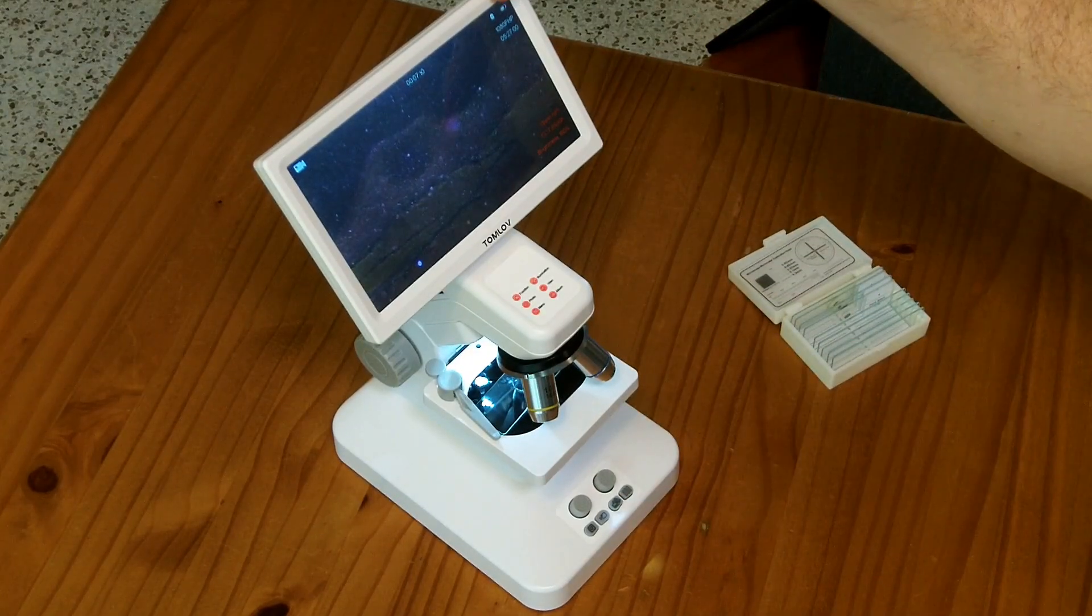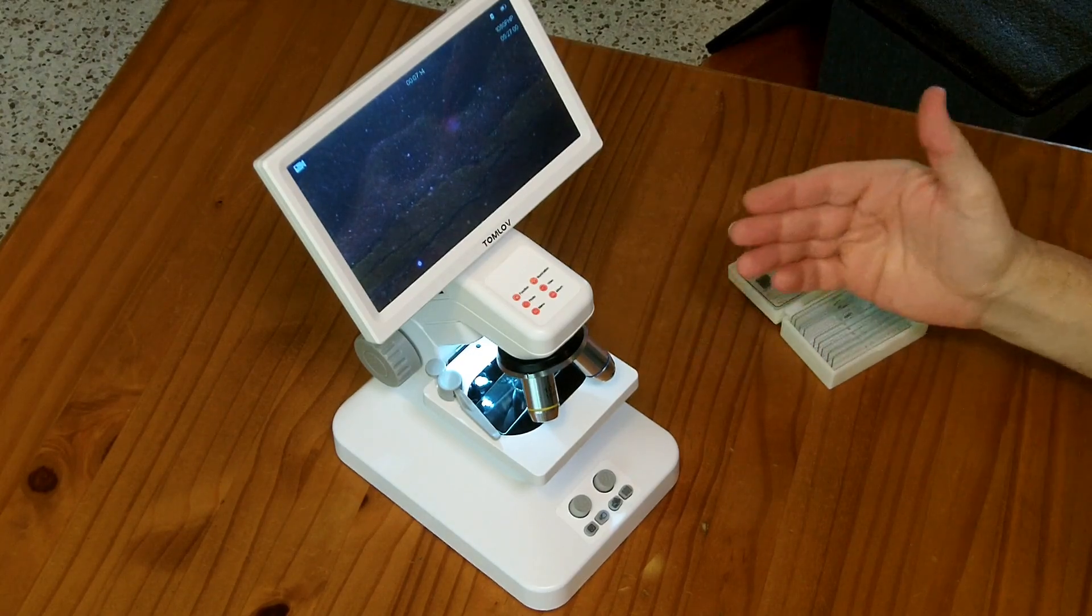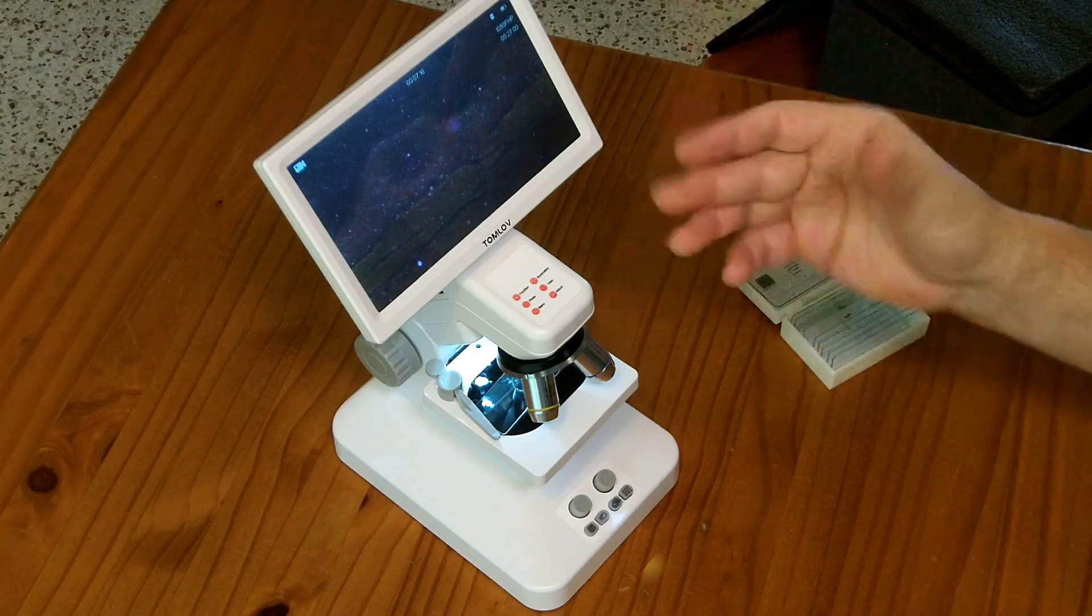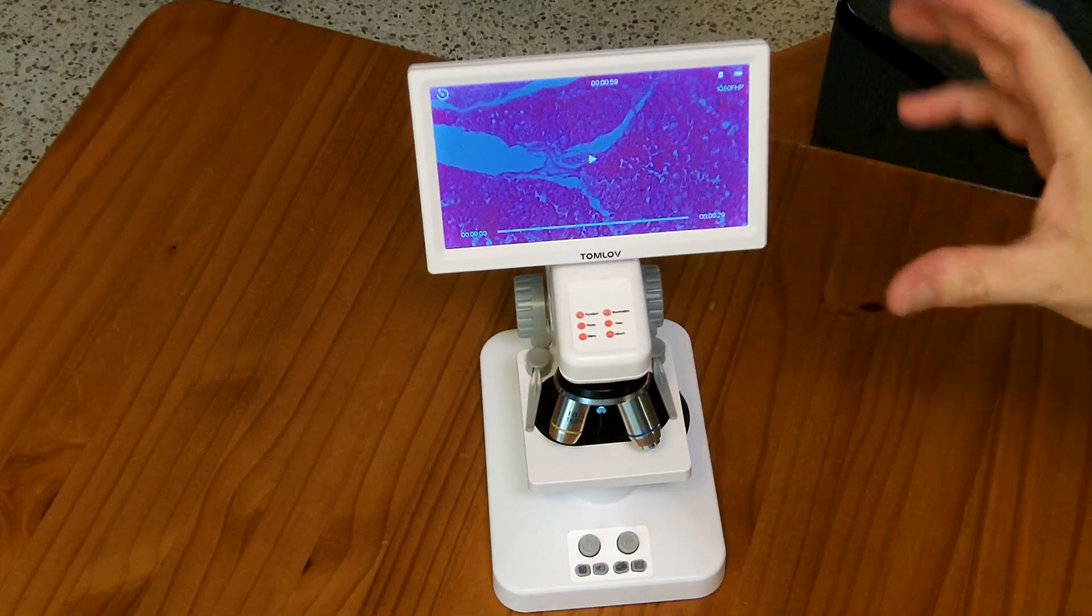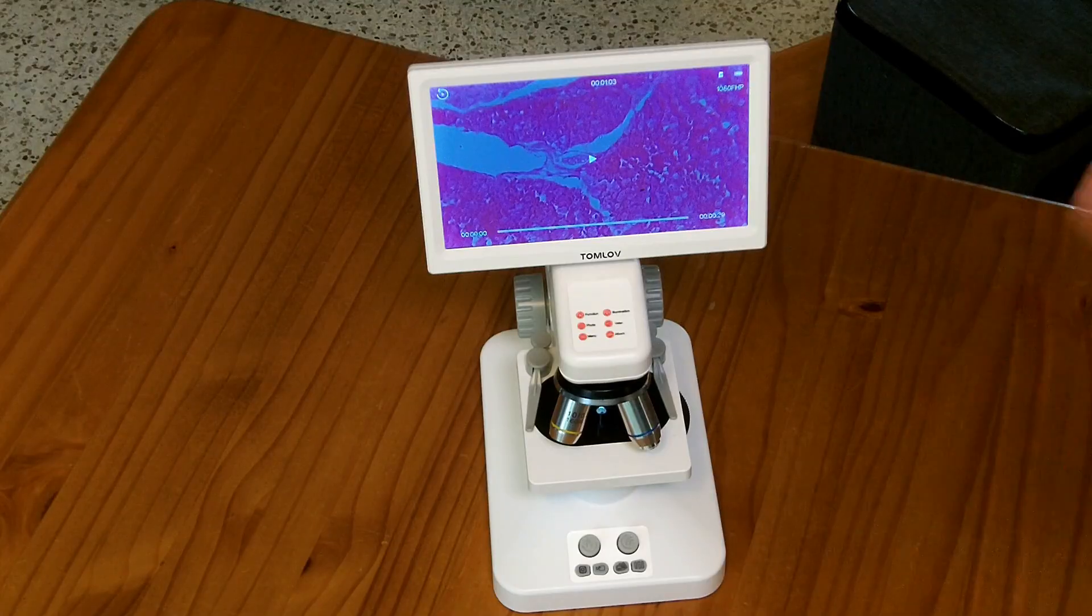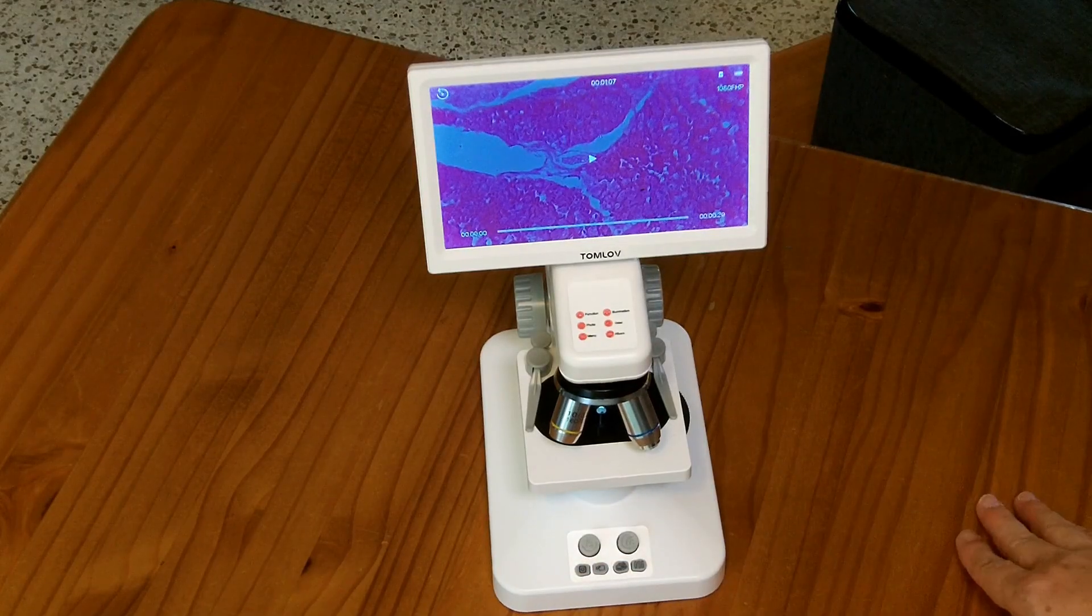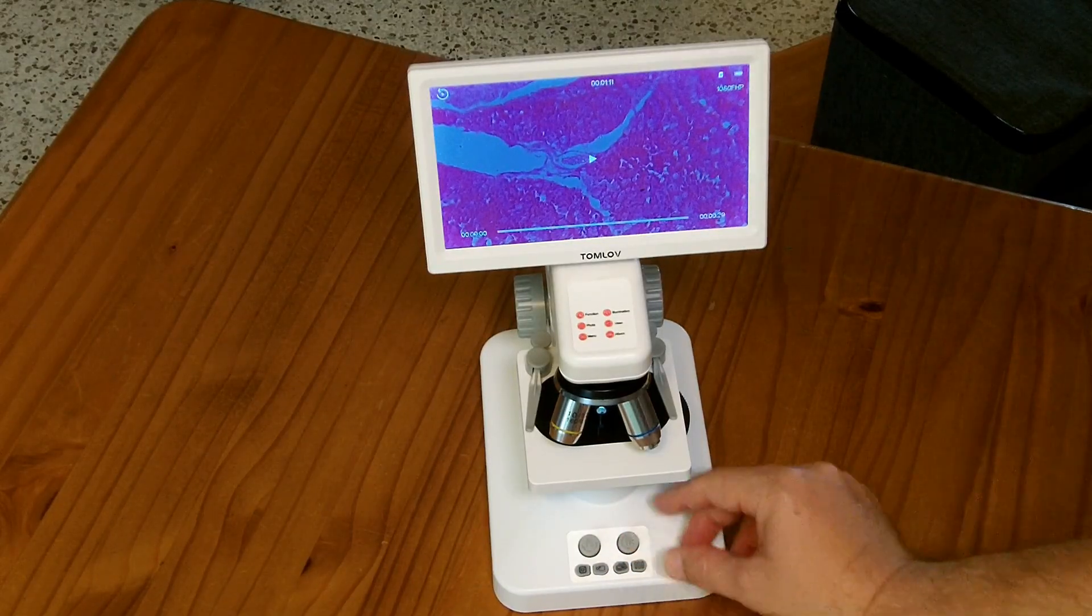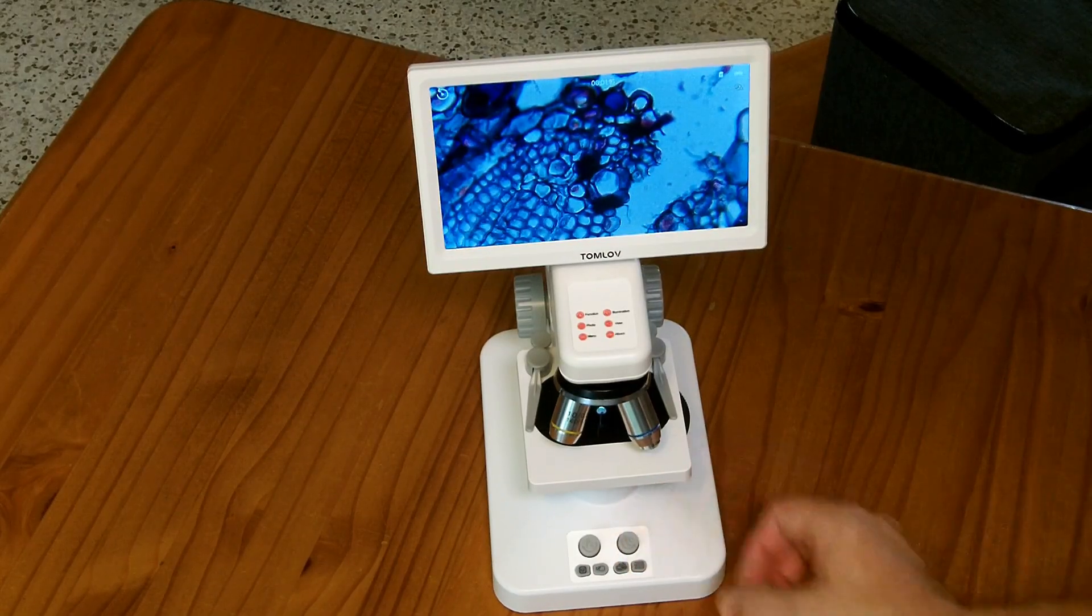Now the battery display is showing one battery bar down. So it's possible that the cell that comes with it doesn't have a super long battery life. But it's been working here for five minutes or so. I've been pretty happy with the optics here. It does a good job. You've got the three different lenses for the three different magnification levels. User interface is pretty easy to figure out. You've got a knob for the lights. You've got a knob for controlling things. So in this case, we're switching between the different pictures and videos that we've taken before. There's the menu button. There's playback pictures and videos or actually just see what's on the screen. And then it just has, do you want to take a picture? Do you want to record a video?